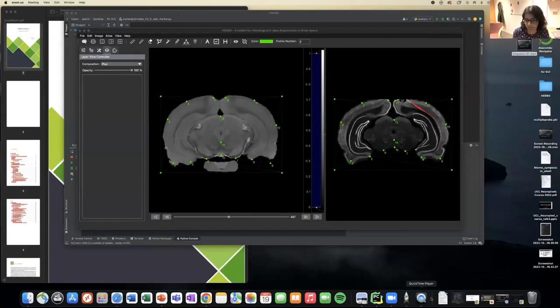Hello. So the software Herbs. Now I need to share my screen. Herbs is this software which previously I showed that you can plan trajectories. Not just that, you can also register your probe tracks, tetrodes, optical fibers, and also viruses, similar to what BrainReg is doing.